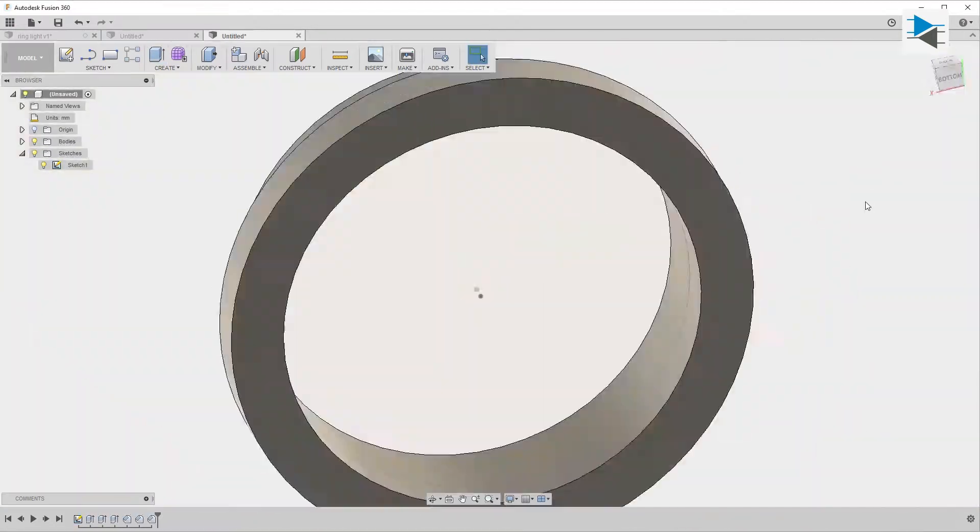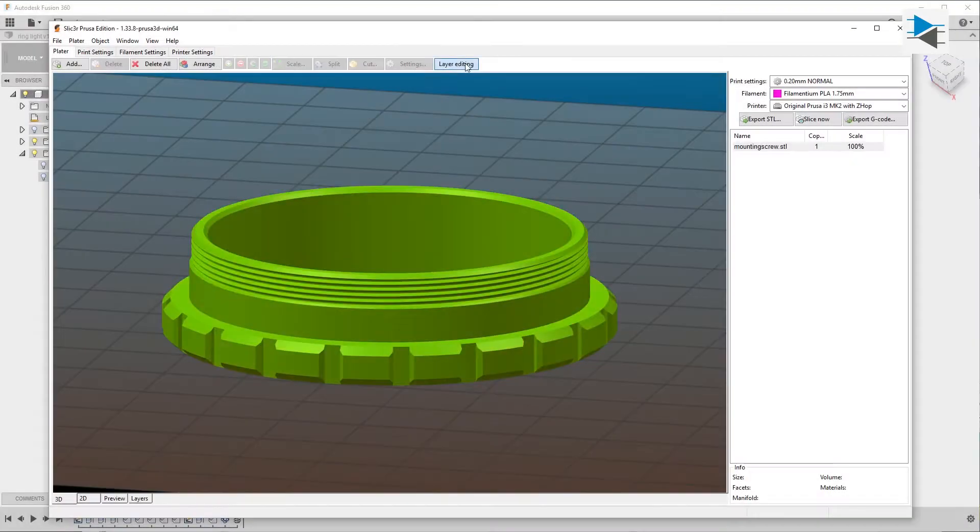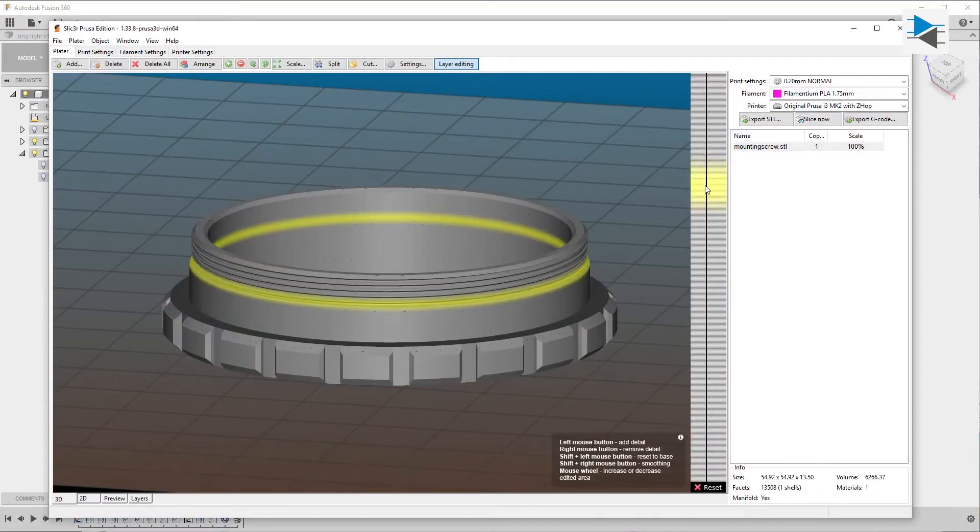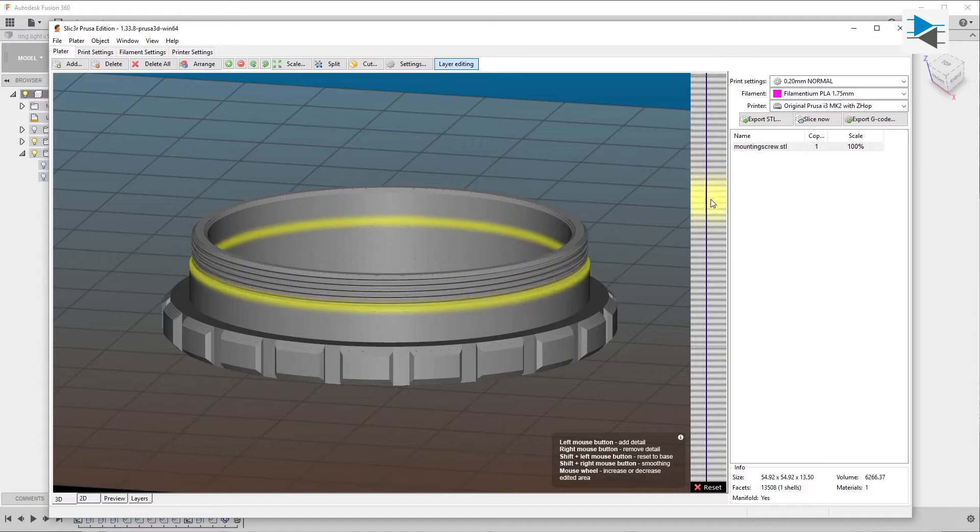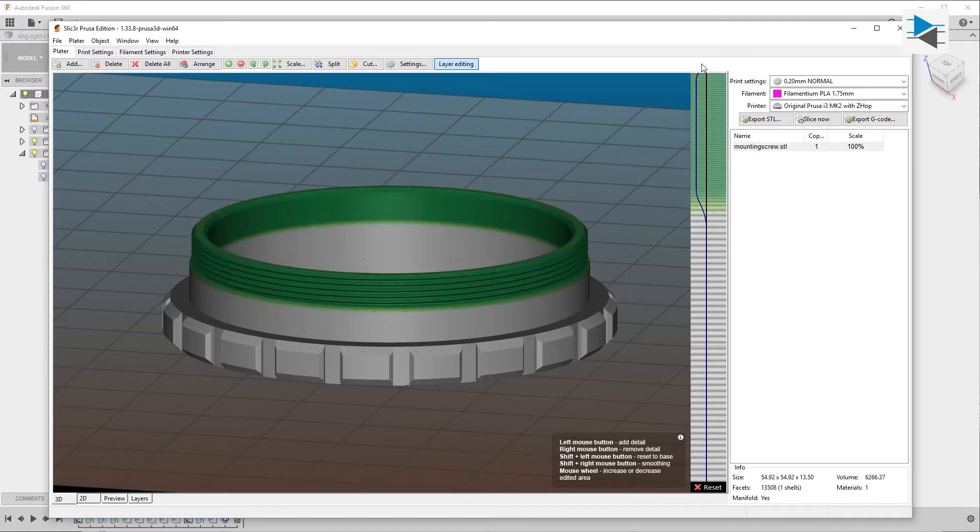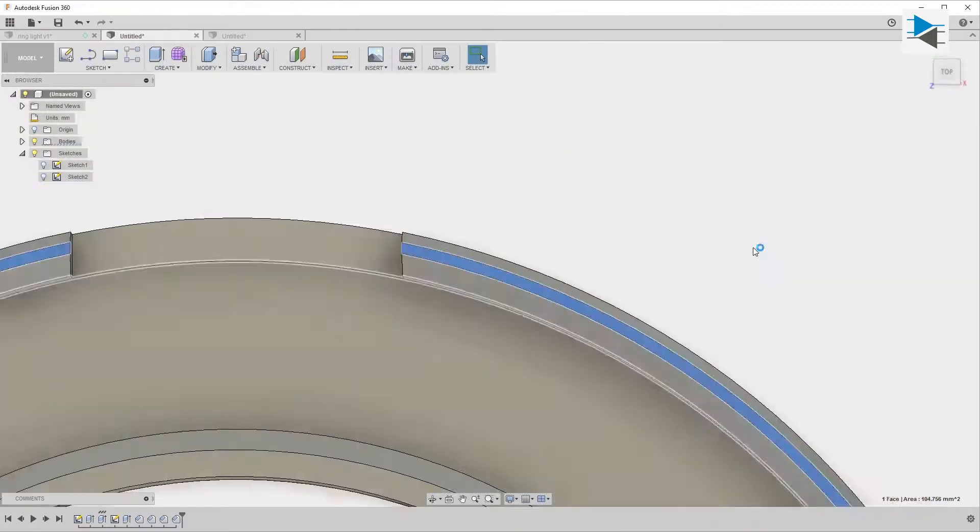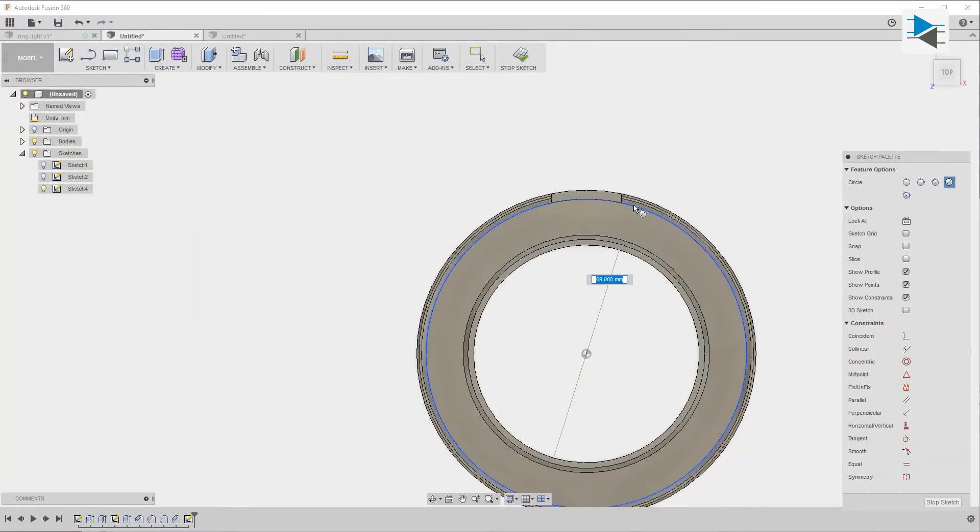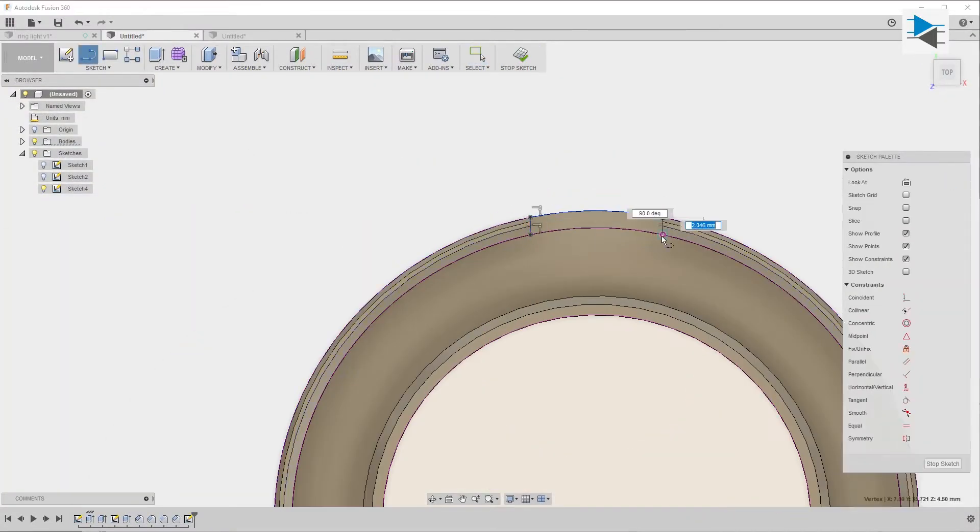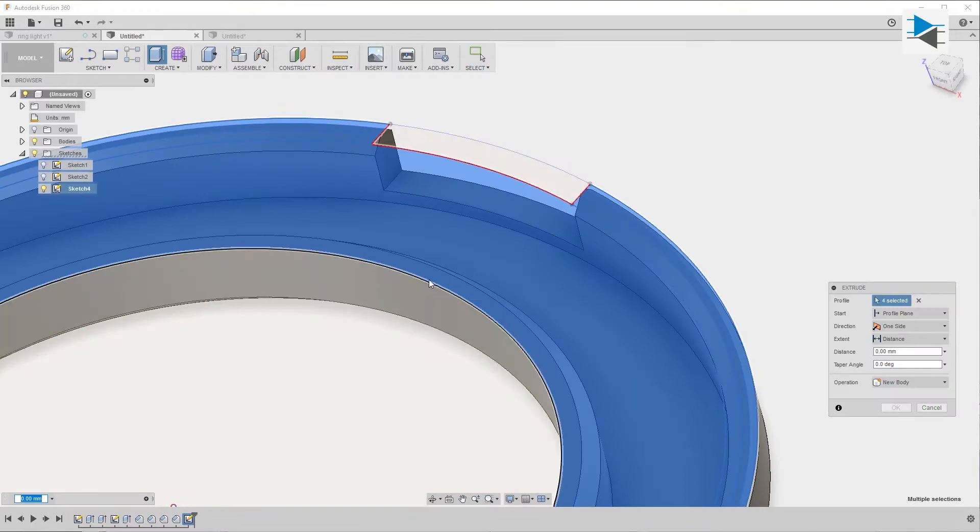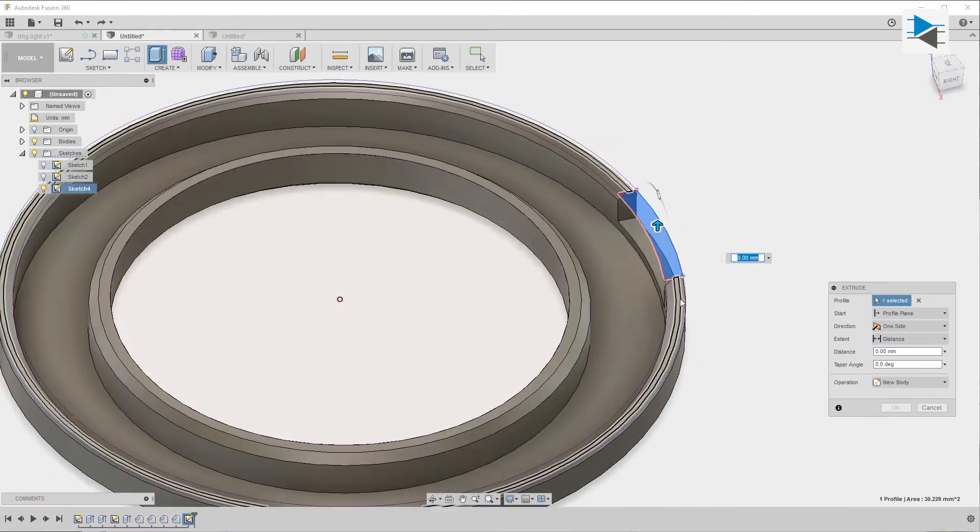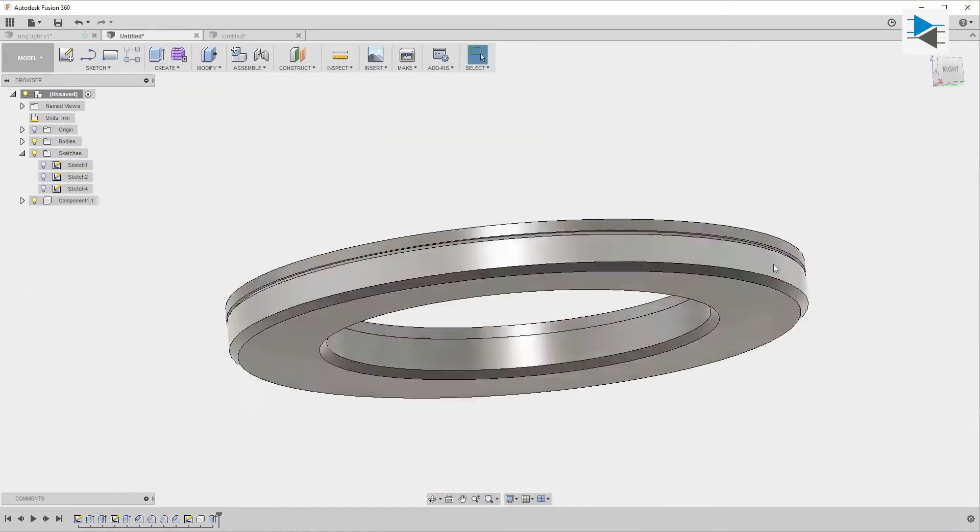I used a variable layer height function in the Prusa edition slicer to cut down on printing time, as fine tolerances are only needed in the thread portion. After revising the holder where the bottom layers are used as a diffuser, I came to the conclusion that the tolerance of the mounting piece are not quite where I want them.